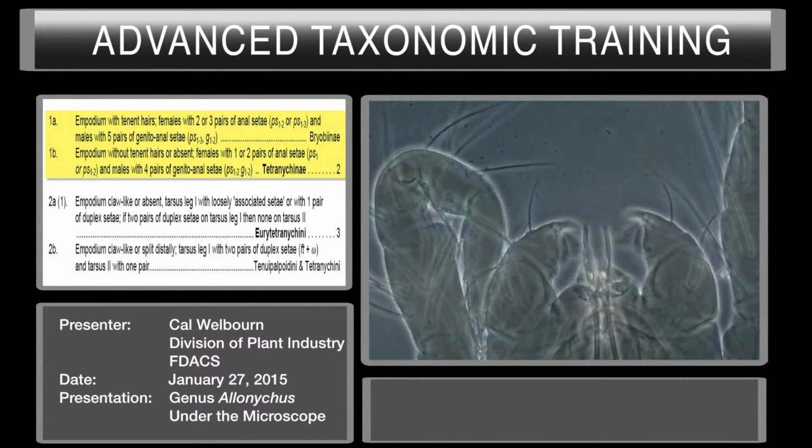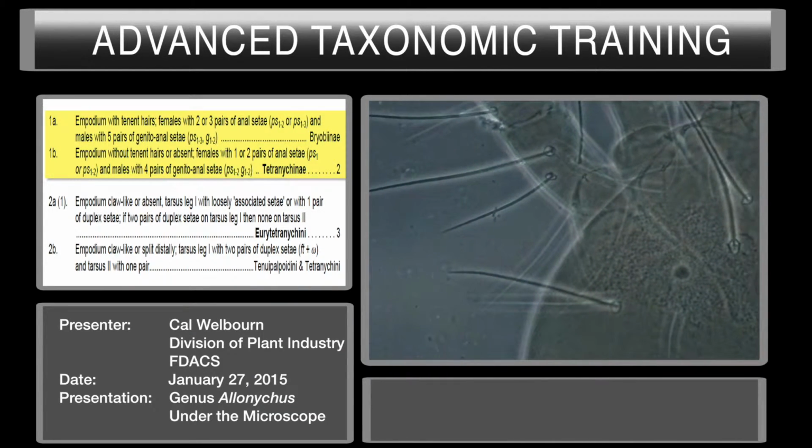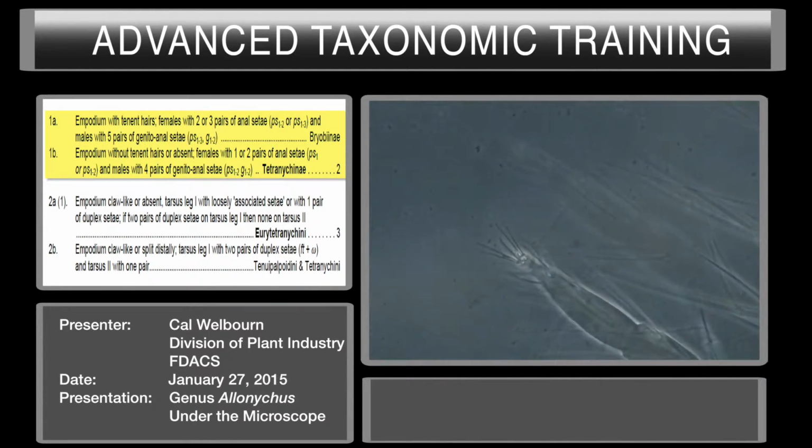In this case, we're operating at 40x. This is a good view of pretarsus leg 2. You can see the claws. They're actually, this tiny little nub there is the claw, and the tenent hairs coming off of it. There's the other claw with tenent hairs. And the structure in the middle is the empodium, but you don't see any tenent hairs coming off of it. Let's look at another one that might be a better view.